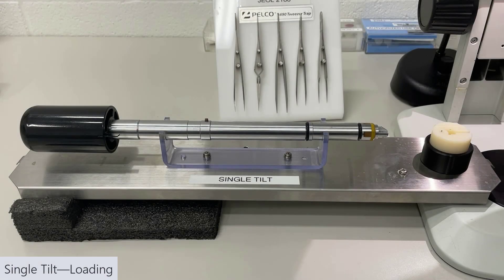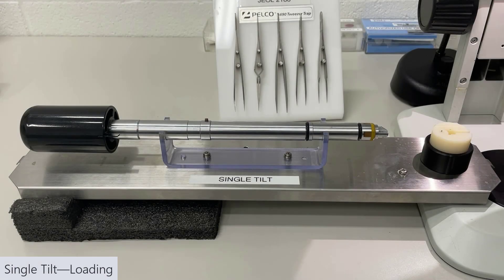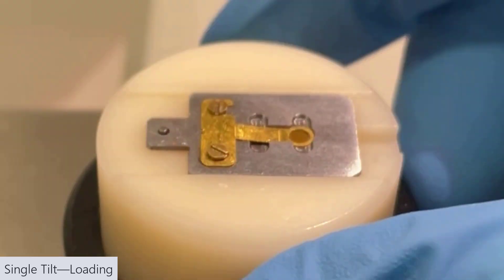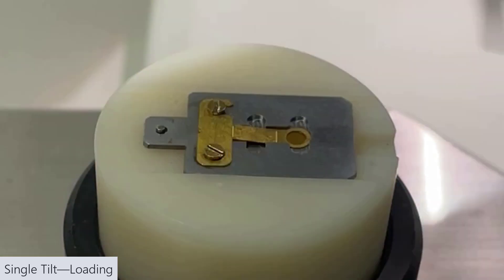First, let's start with the single-tilt holder. This one only tilts in the X direction and is good for most samples for imaging. Here's our holder. In some cases, we do take the blade off. So if your lab does that, this is the process you'll use. Put your blade in the little holder.